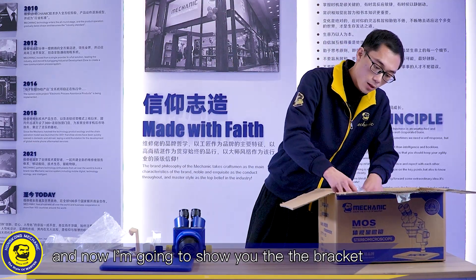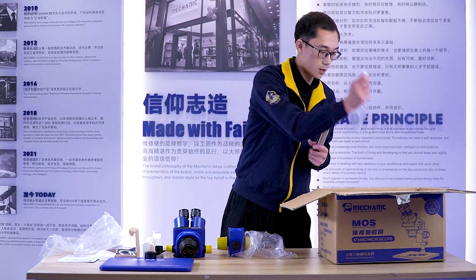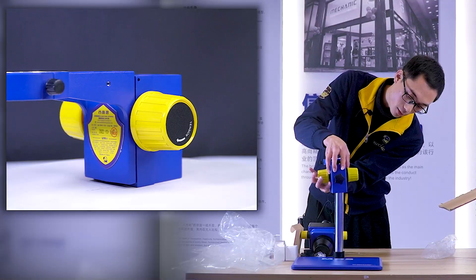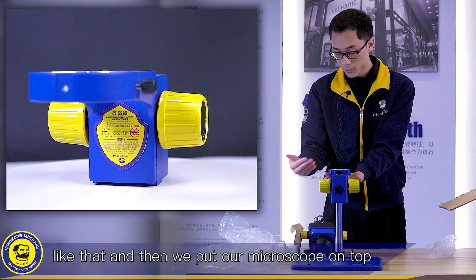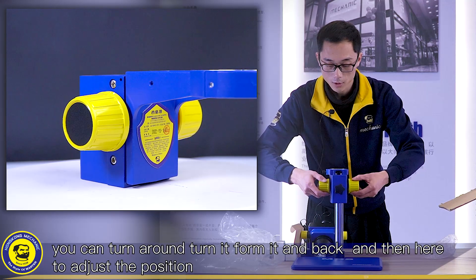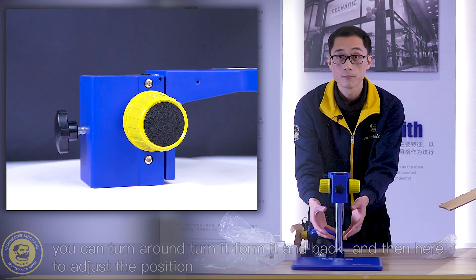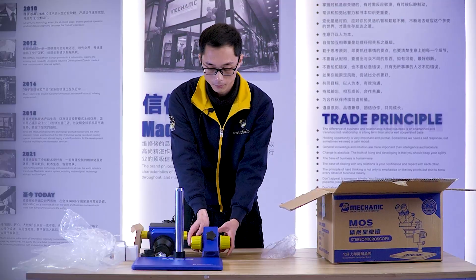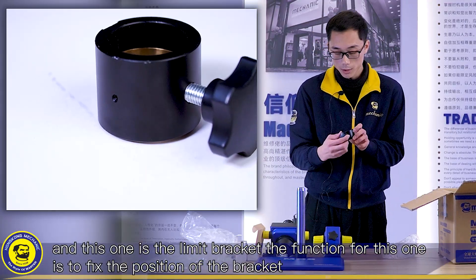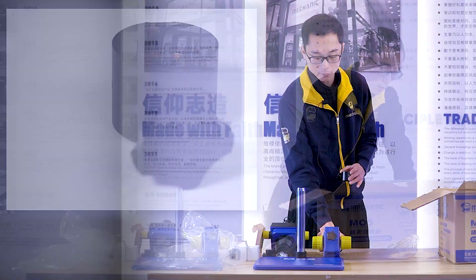Now I'm going to show you the bracket. Here's the metal bracket — put it here, and then we put our microscope on top. You can turn it forward, turn it back, and adjust the position here. This one is the limit bracket — its function is to fix the position of the bracket.